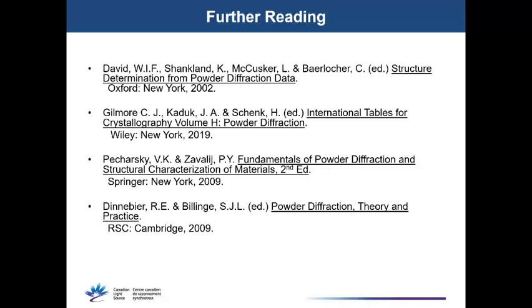So for inorganic structures, does DFT work, or do you have to use other different software? DFT can work. Yeah. I'm thinking like organic molecule is more like isolated, right? So for inorganic, it's more like... Organic can tend to be simpler for using the DFT. You don't have to use as many reciprocal space points for your modeling. So it can be faster using organic structures, but you can do inorganic structures as well. Yep.